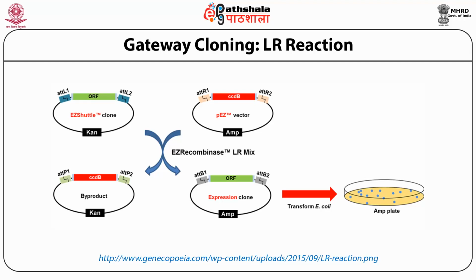So this reaction mixture containing both the byproduct as well as our expression clone is transformed into competent cells, and based on the antibiotic, because our destination vector contains ampicillin in this case, we screen these transformants on an ampicillin plate. So we only screen for the expression vector while the byproduct cells are not screened or are killed during our selection. Therefore, we clone our gene of interest from an entry vector into an expression vector in this reaction.